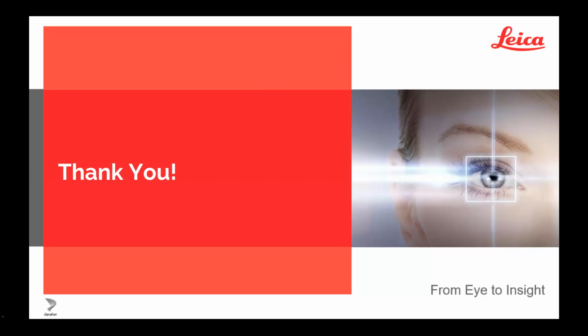For metal sputter, there's a slew of materials. I talked about many of them in the presentation today. But yeah, there's a good 8 to 10 or so kind of standard metals that you can coat with. And then on the carbon side, it's really carbon. We have either carbon thread or E-beam evaporation available.